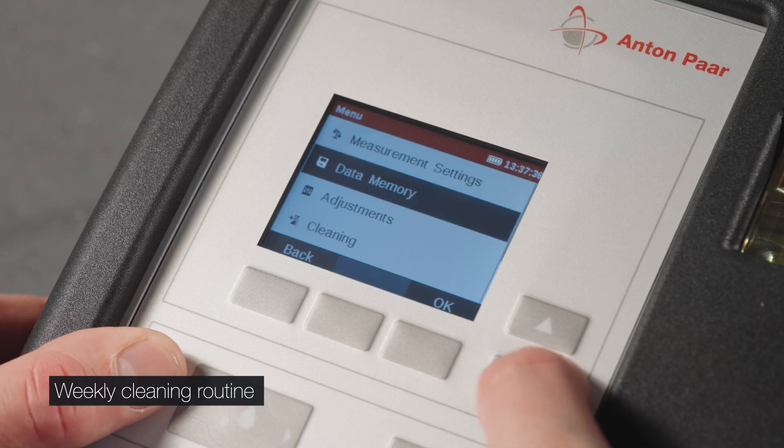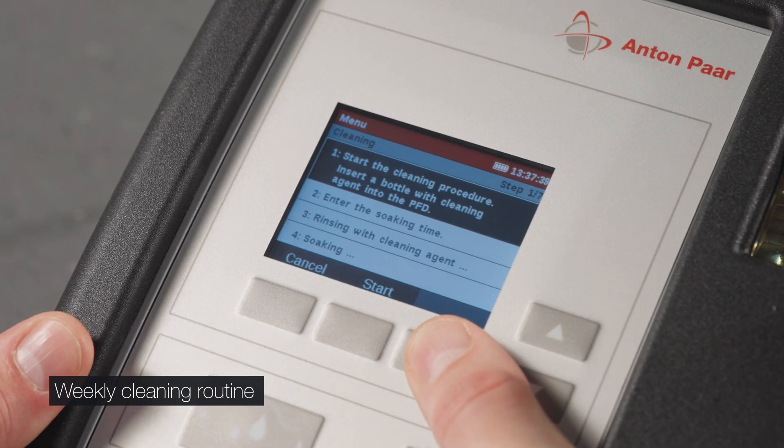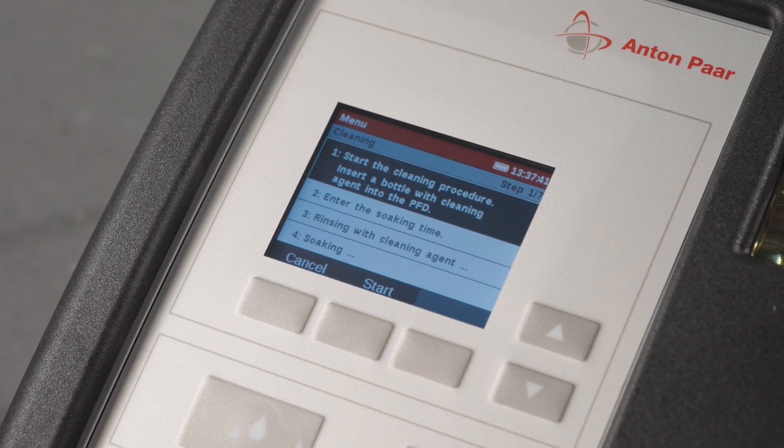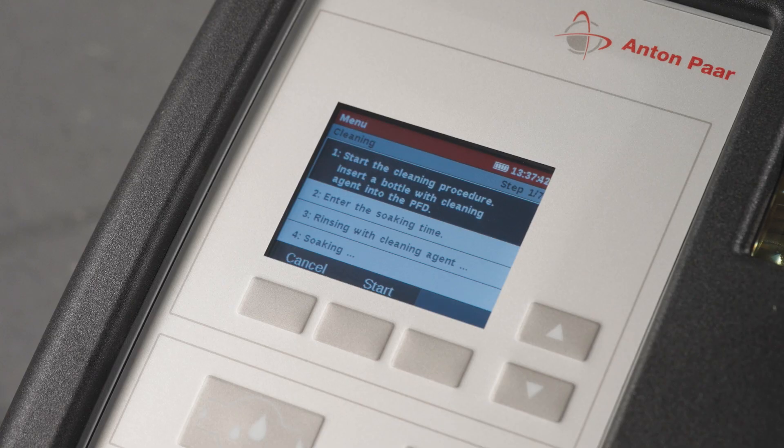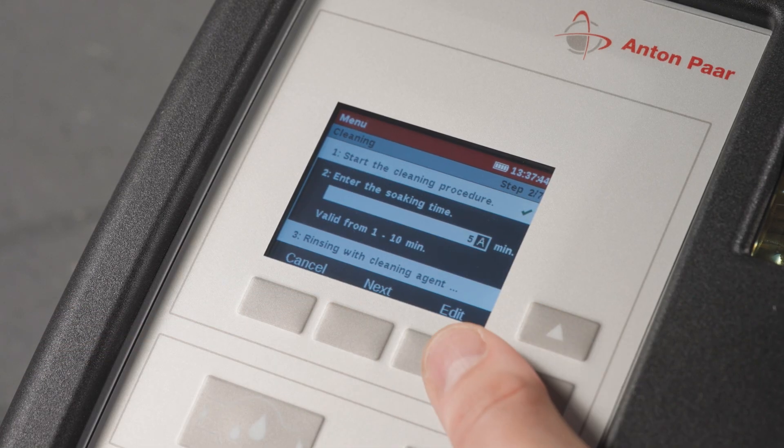Once a week, perform special chlorine-based cleaning using the cleaning function. Insert the bottle with the cleaning agent into the PFD Plus and activate it. Start the cleaning procedure and follow the guided wizard.